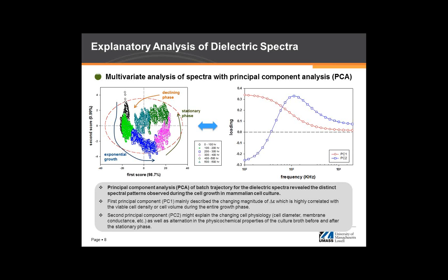On the upper right corner plot, we have the two calculated principal components. The red line is the first principal component, and the blue line is the second principal component. Those are the most distinct and obvious variabilities observed in the dielectric spectroscopy. As you see, the first principal component is almost the same as the dielectric spectroscopy pattern. And the second one has a pretty low value in the low frequency region, then increases around the corner frequency region and then goes down.